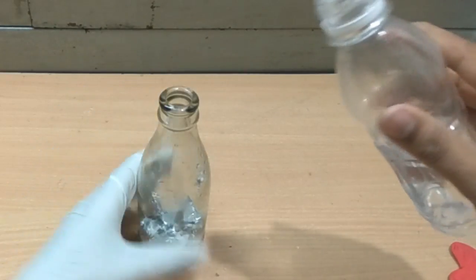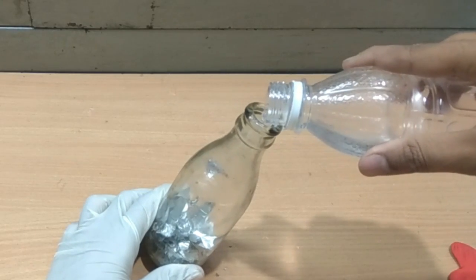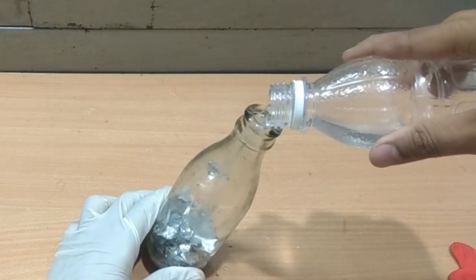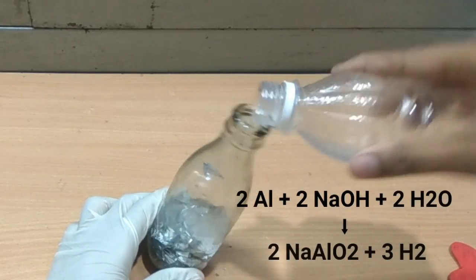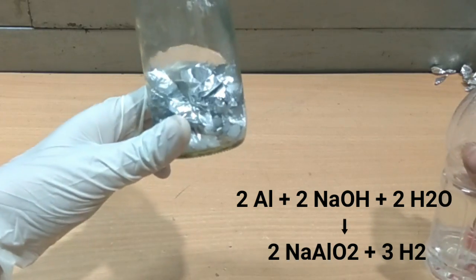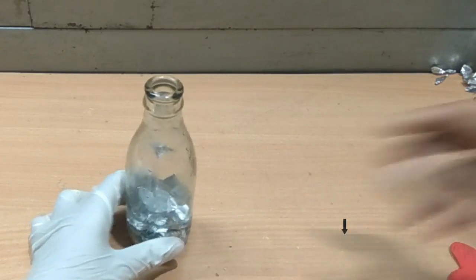Solid NaOH dissolves in water and starts reacting with the aluminum. This reaction will occur in the glass bottle and release hydrogen gas. Give a quick shake to the water.